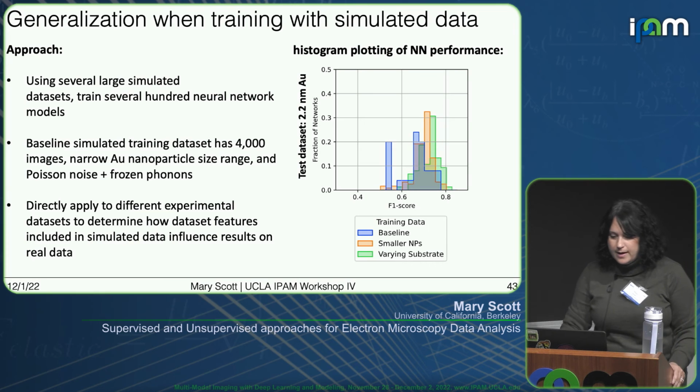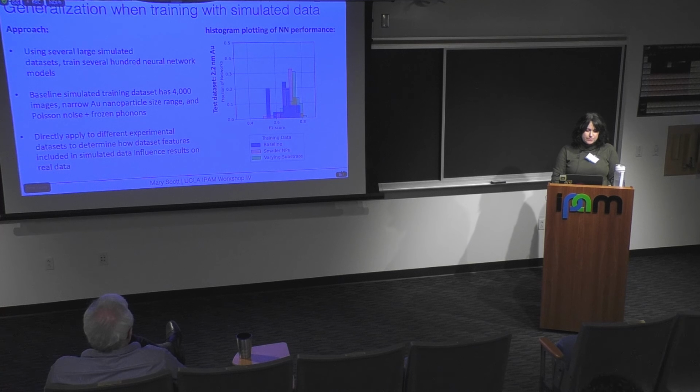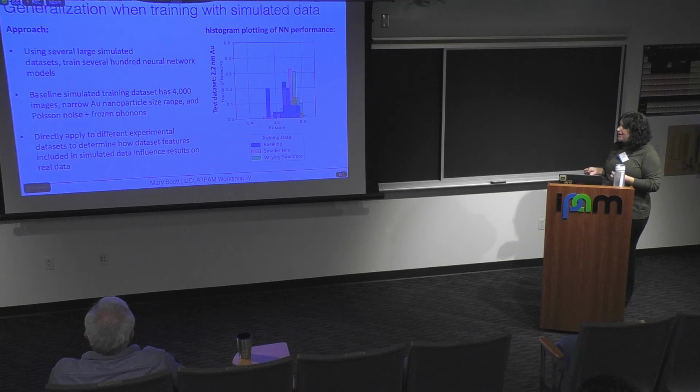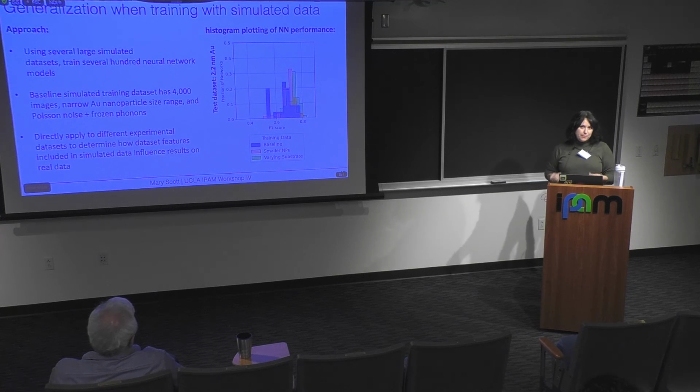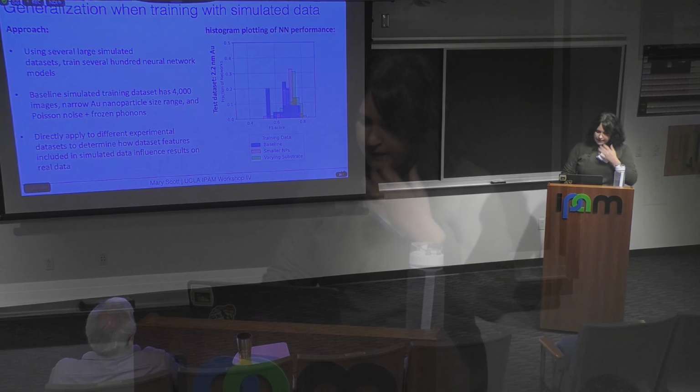And we see that we can get very high performing models just from a simulated approach. By the way, this is all on a lightweight U-Net, very similar to the results that I showed in the first part of this talk. So we're kind of in the scenario that we were at before we implemented consensus clustering, where you can be certain that one of your models will probably be pretty high performing on your data set. And now the real work of this project is to guarantee that that happens.